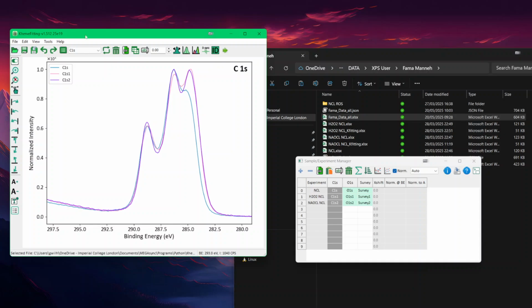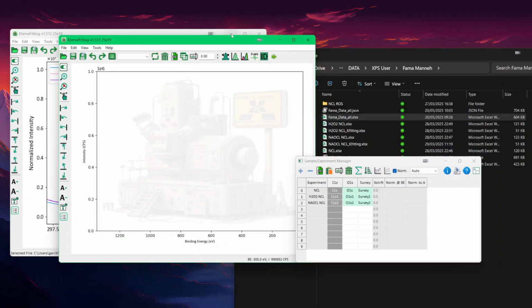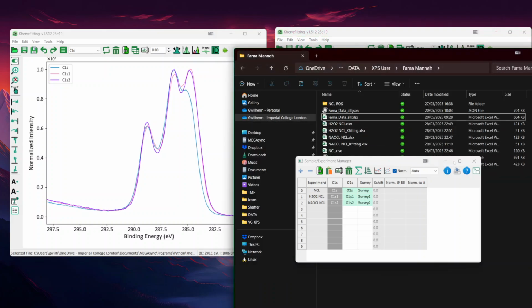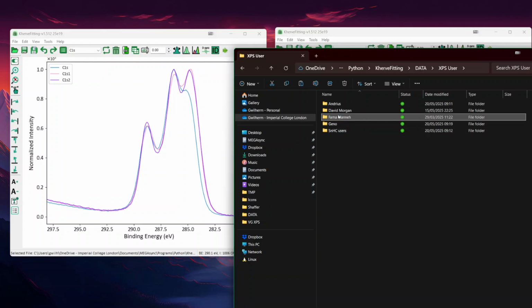On that window, it will be a child of the main window. So the main window is this one. So let's do the same here. I'll open maybe something else here. Let's say I open a standard sample.